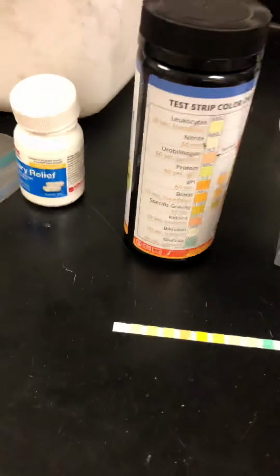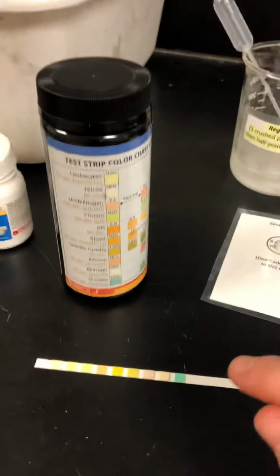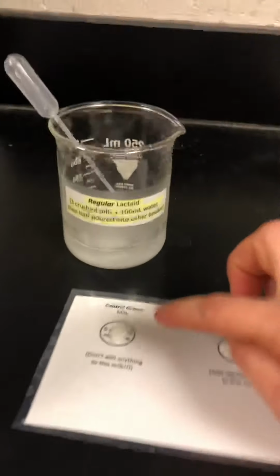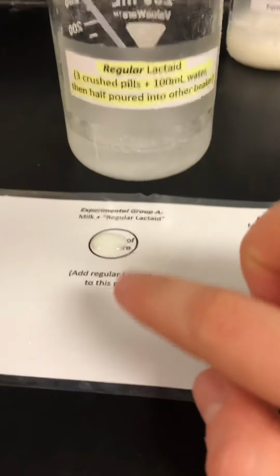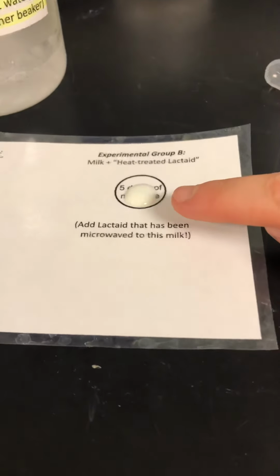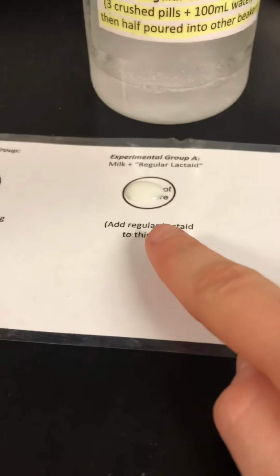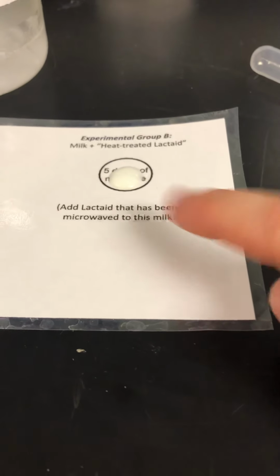Okay, where were we? So we're looking mostly at glucose. We want to find out how many monomers of glucose there are in our milk. And we're going to have 3 puddles. Our control group, which we'll just leave as plain old milk. Then we're going to have our regular Lactaid. So we're going to take our unheated Lactaid and add that to some milk. And then the heat-treated Lactaid, we're going to put that in our last sample of milk. So we're going to see how Lactaid affects milk normally, and then once we microwave and boil and really heat up that Lactaid, what happens then.